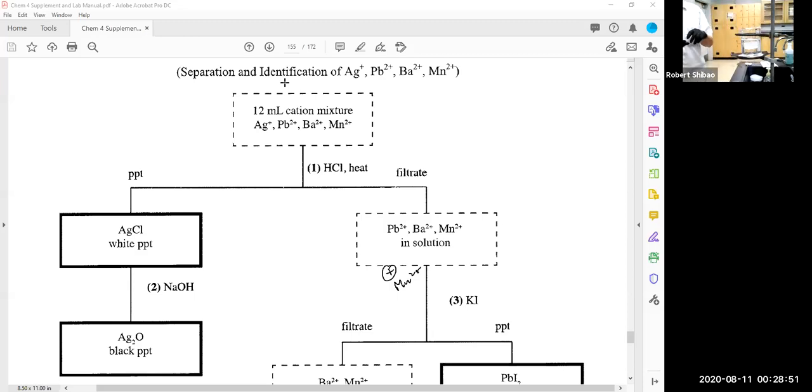Boiling chips are just little quartz crystals. Dump some boiling chips in there. Okay, while that's heating, you know, don't want to waste the time. And so what we can do is test some other unknowns. I'm going to heat this up in here. I'll just leave that in there. We'll test some other unknowns and see what we get.